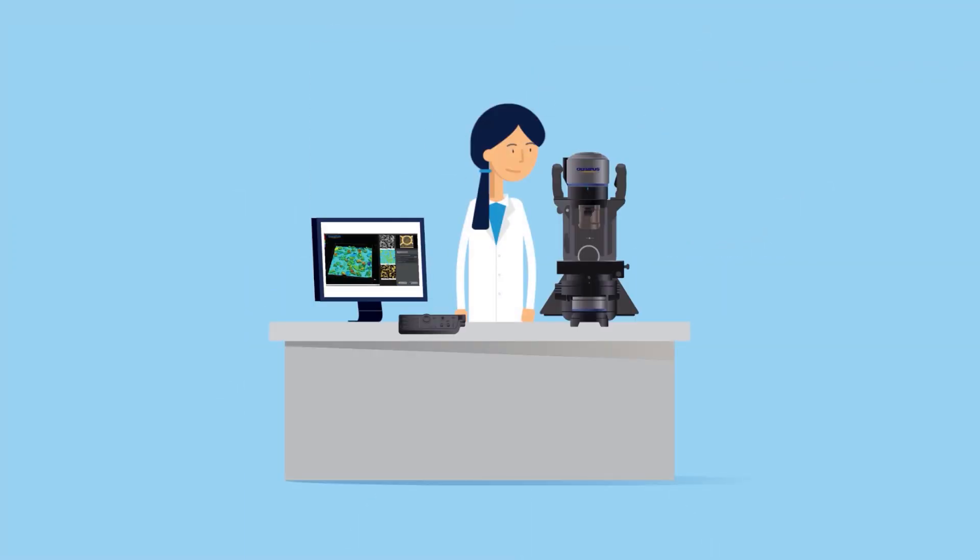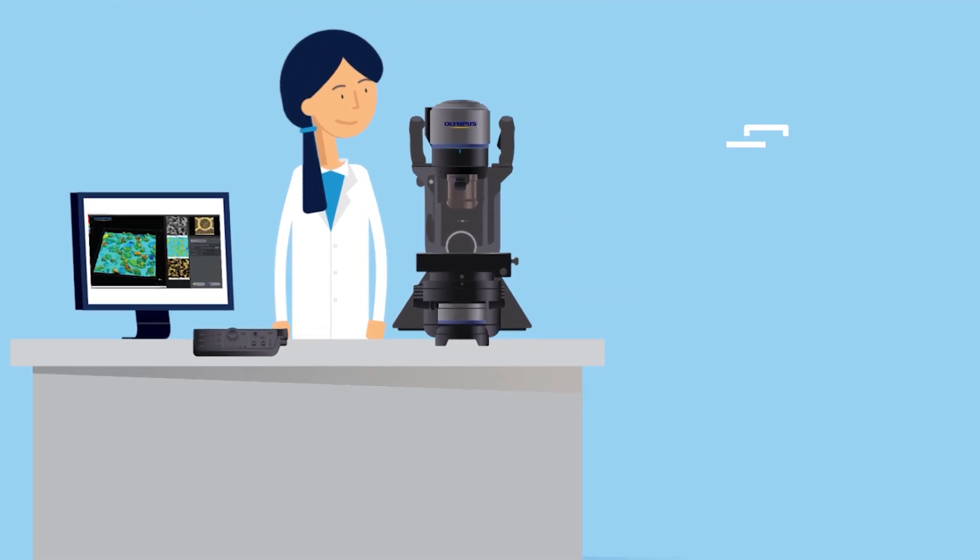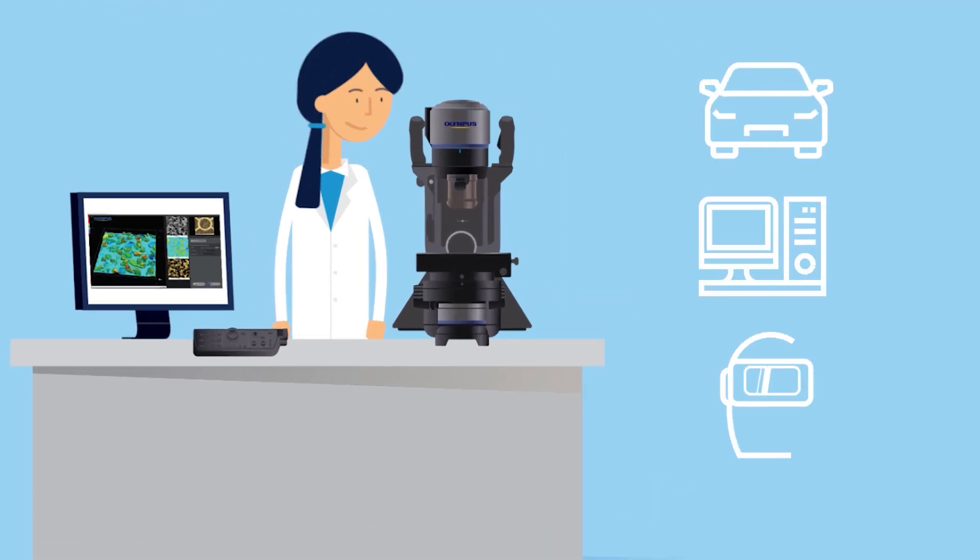The DSX-1000 Digital Microscope from Olympus is the ideal inspection tool for material science, manufacturing and industrial applications. From inspecting automotive parts to electronics and metal fabrication, this flexible tool combines outstanding optical quality with ease of use.